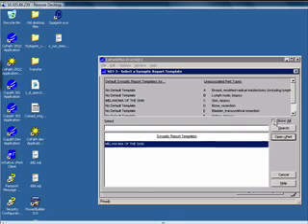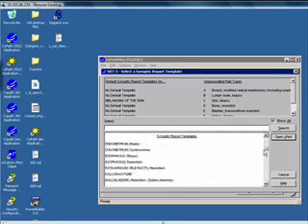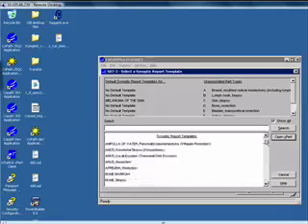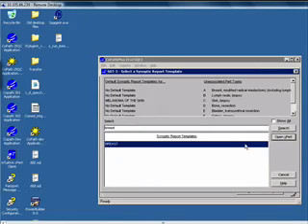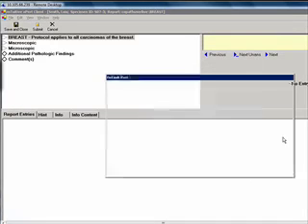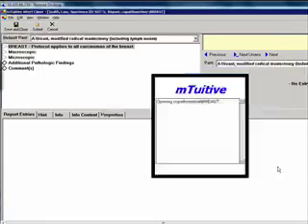If you click on the Show All box, you will see a list of all the templates that are available. There's a synoptic report template available for each checklist produced by the CAP. Now, we'll type breast into the search box and select it. Click Open xPert. We'll select the default part type by clicking OK.